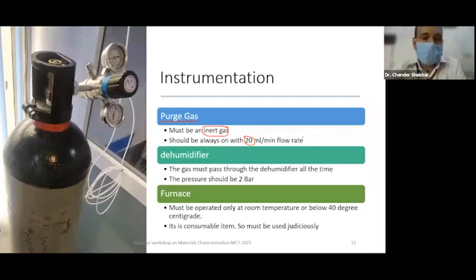If a volatile species is being generated, it may corrode or deposit onto the sides of the chamber, because the temperature sensors are very sensitive. The thermobalance is very sensitive. So these vapors generated in the chamber need to be taken out. The inert gas must be continuously flowing through the chamber at a constant rate during the entire heating and cooling cycle.